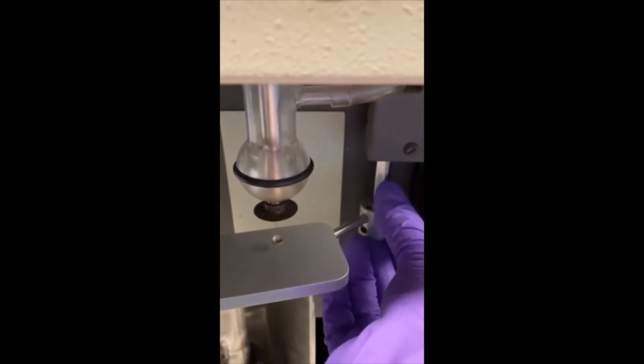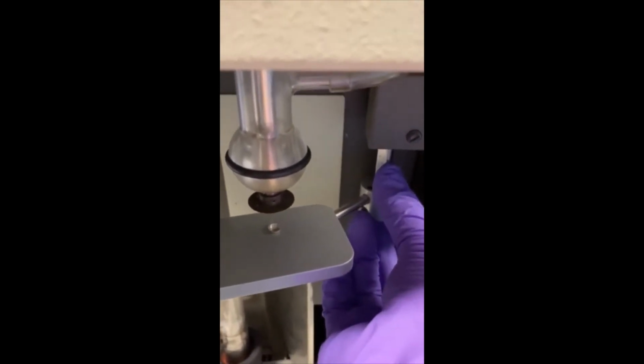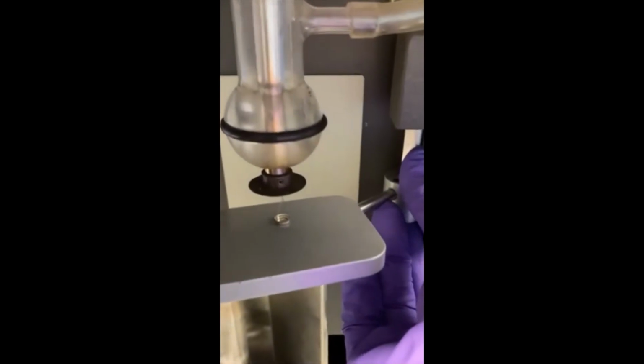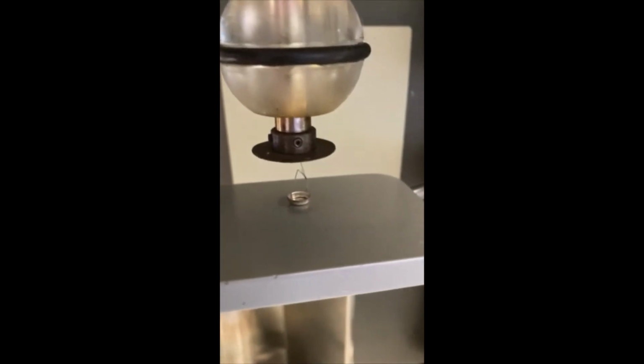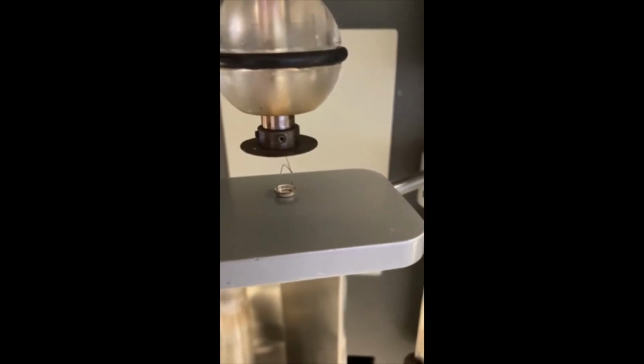To set up the sample in the pan, we use the platform to support the pan in the basket. Be careful to keep the basket on the wire hook.